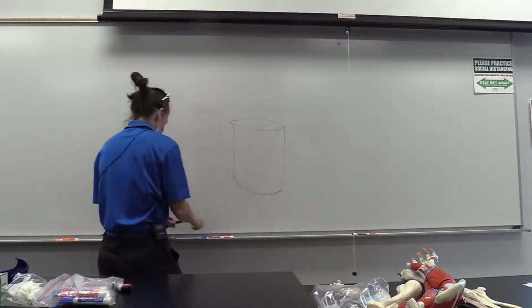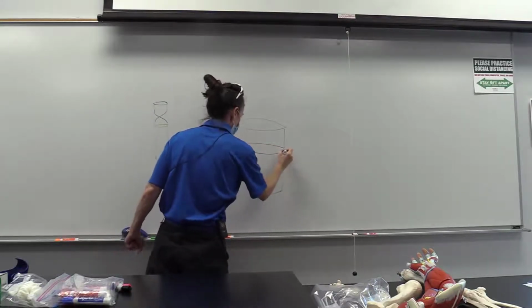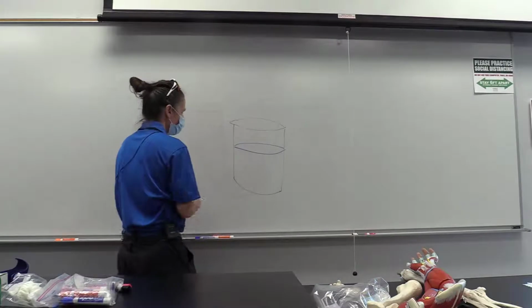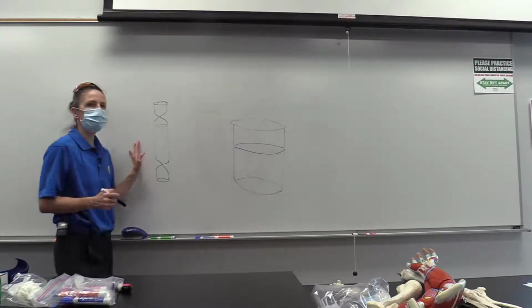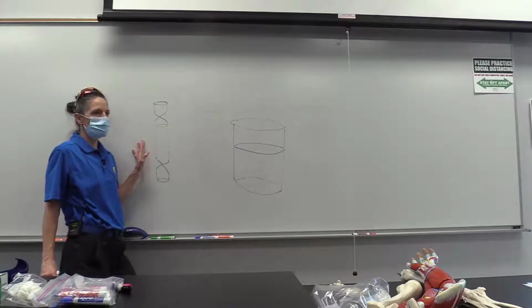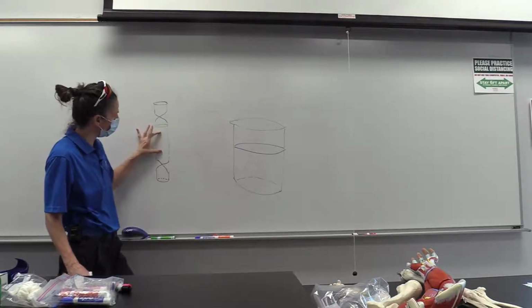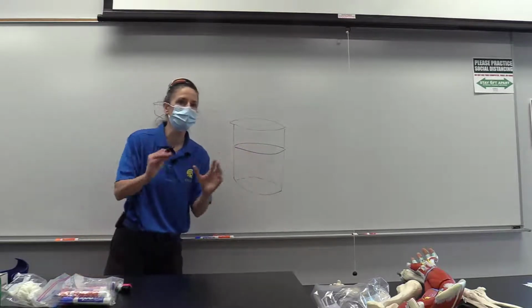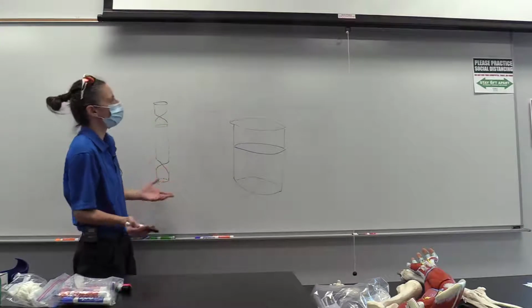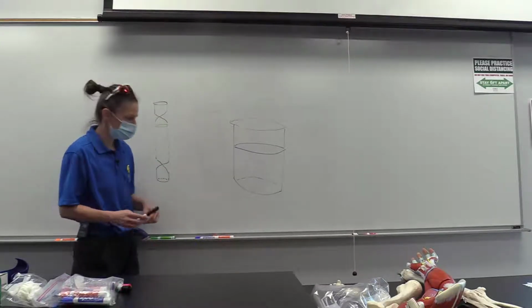And remember, once again, that these pores are big enough for water and small dyes to get through. And the dye we used was called methylene blue. There are other small dyes that can get through. And basically, we put the dialysis tubing in the beaker. So we have created two compartments now. Depending on what we put in what, we created one hypertonic and one hypotonic compartment.